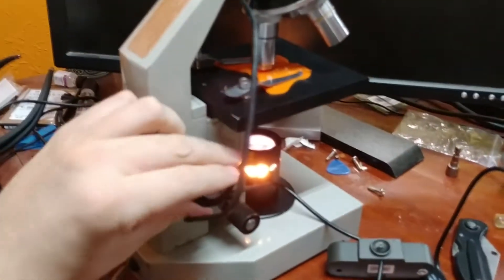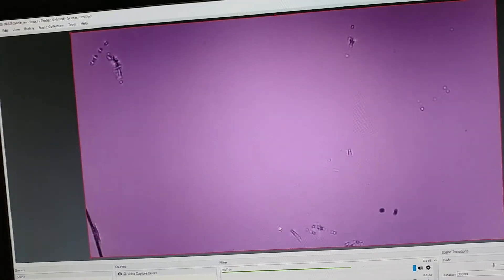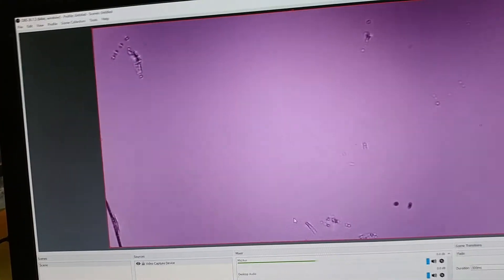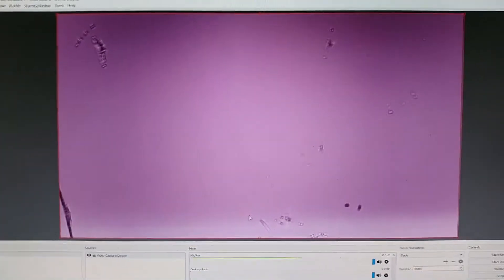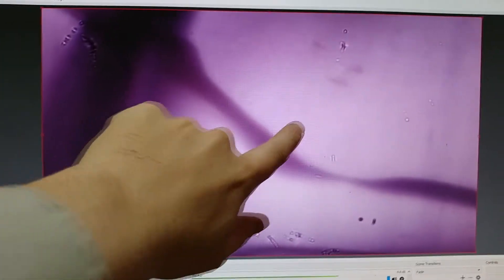It will do 2000x, but let me see if I can get a focus where it'll actually give any sort of an image. It's very picky at 2000x — the optics on this and the adjustment knobs really weren't meant for it. That's about all there is to see on this piece of plastic at 2000x, so this isn't a terribly useful demonstration. But if we pop over to the 500x, you can see there's quite a bit of detail in here. Unfortunately when you go up to the 2000x, it's really zooming in right where there's nothing going on, so there's nothing to focus on to demonstrate it, but it does work.